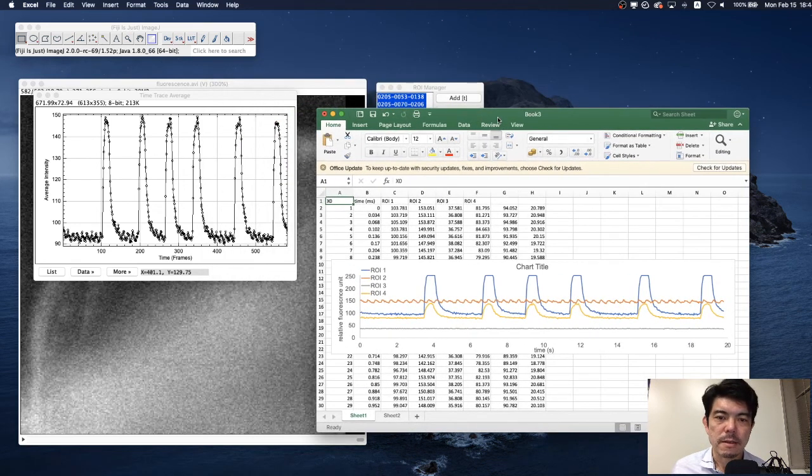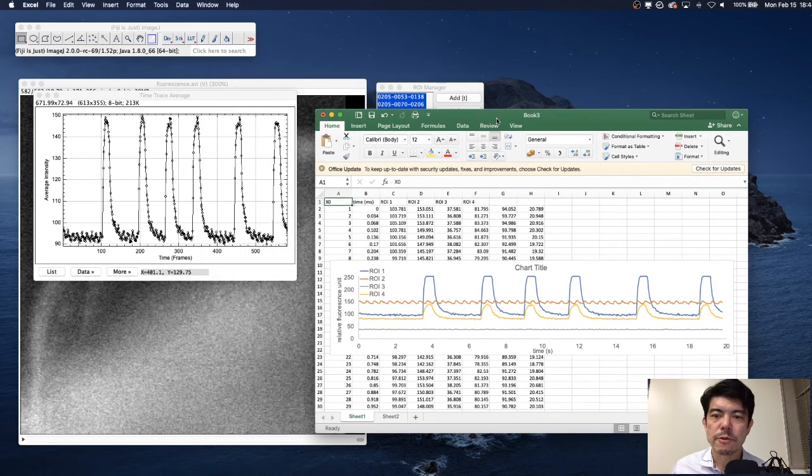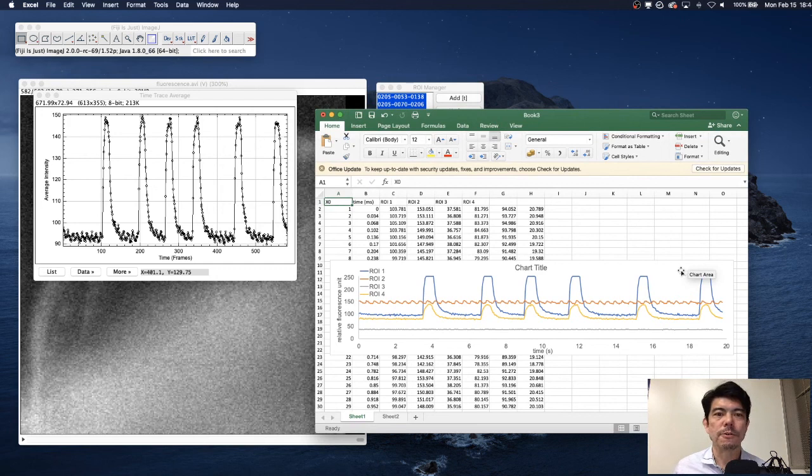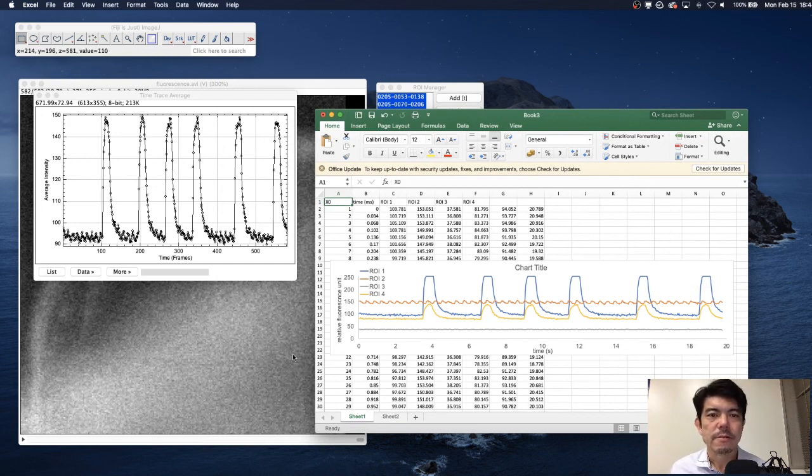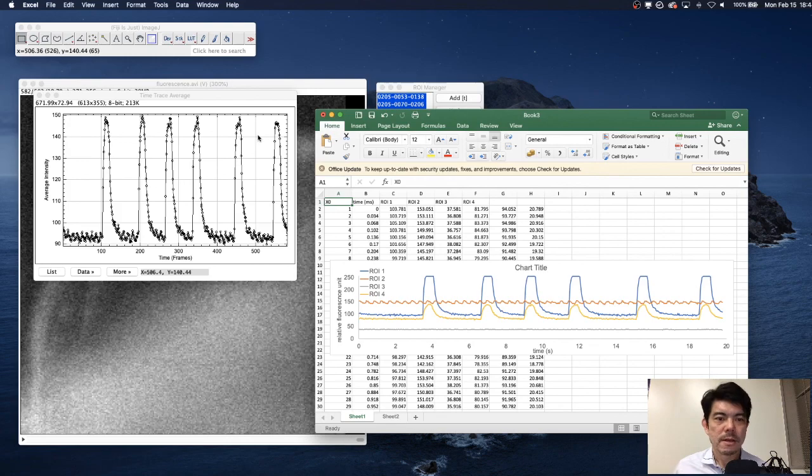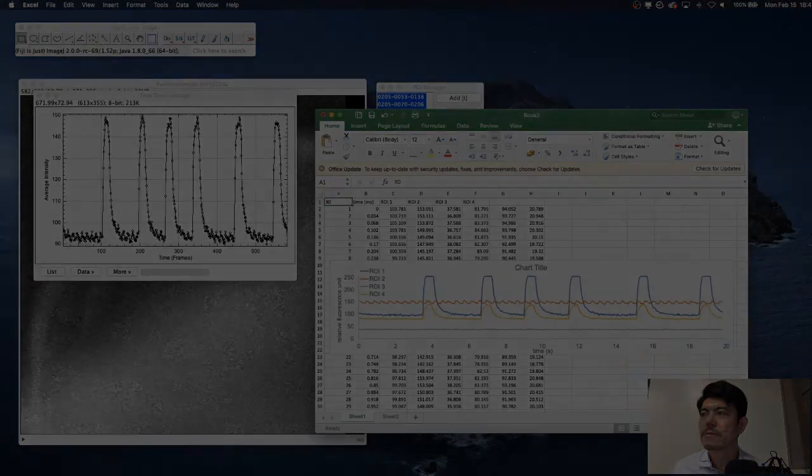And you are ready to use this graph for your nice presentation. Alright, I hope this can help. For more information, alright, it's just one way. Thank you.